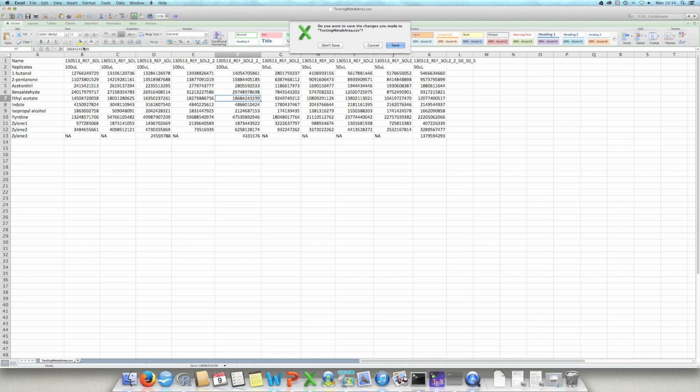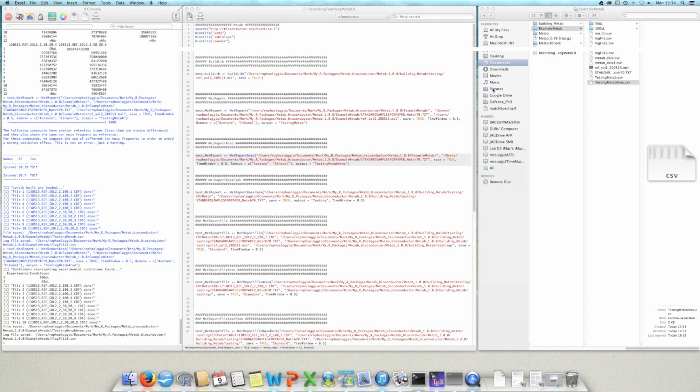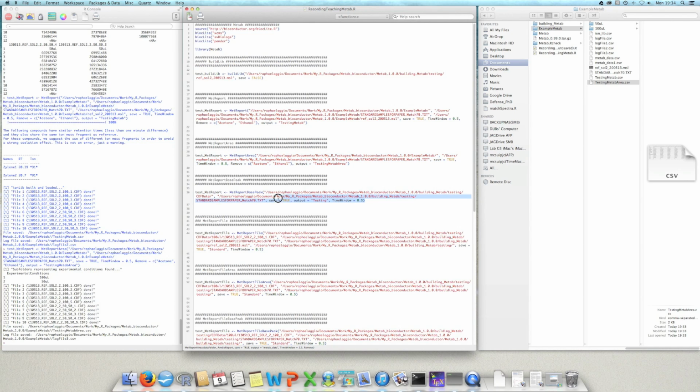very quick. So the second option is to generate, instead of the area, the base peak. I think the area is not too efficient. I don't know, maybe the coelution may change the results that I'm going to have, so I want to use the base peak.